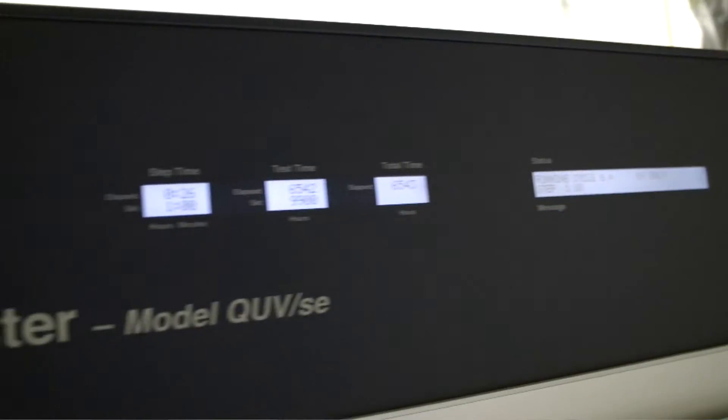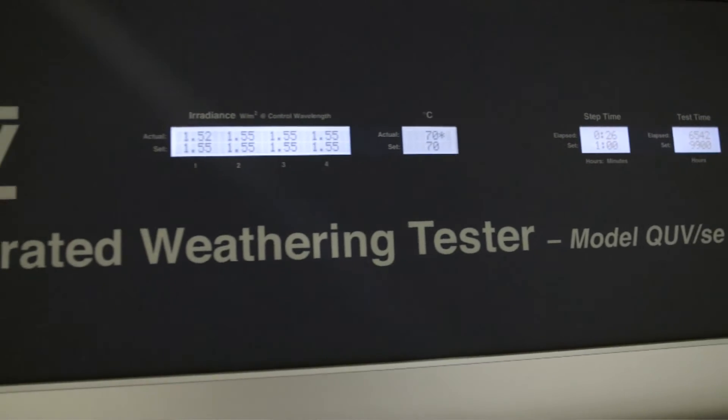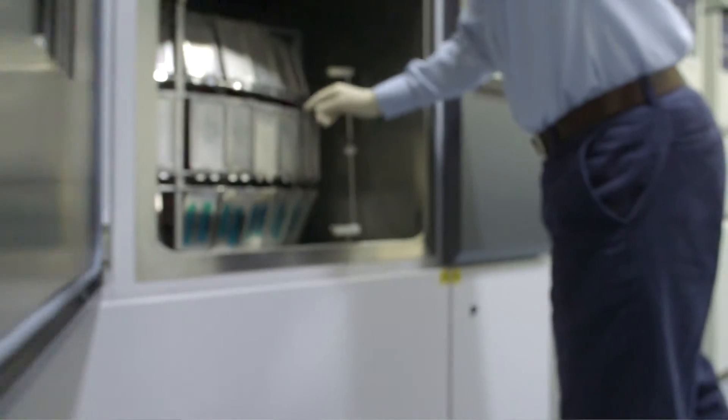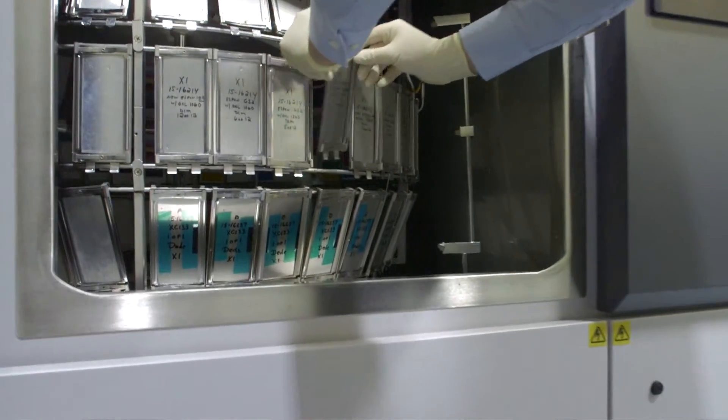This lab contains various types of equipment from UV-only light sources to full-spectrum xenon light sources, depending on which property we're looking to evaluate.